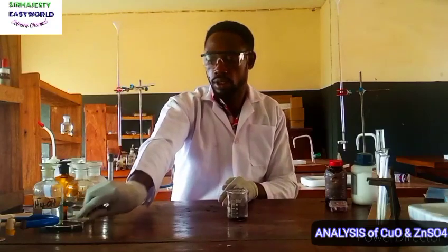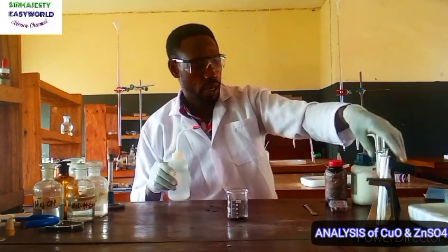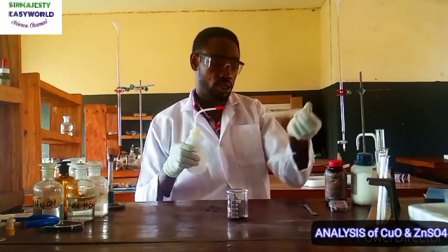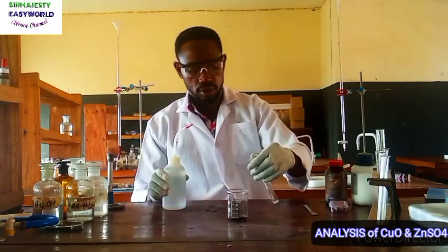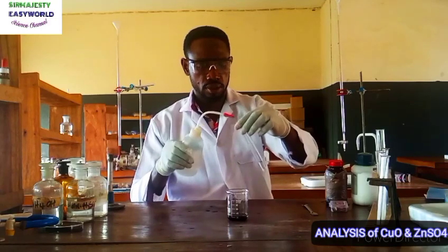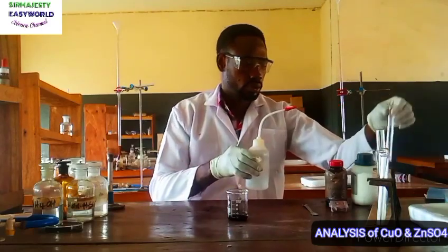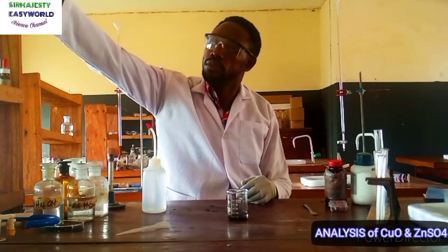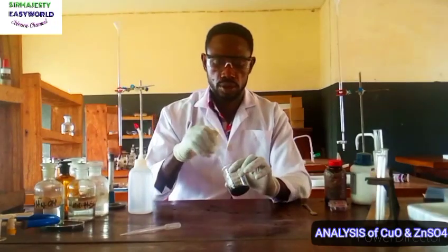Okay, let's put this aside. This is the water. They said about 10 ml. Remember, it's about 10 ml, so accuracy in the volume is not necessary, but this test tube is nearly 10-20 ml, so I'll take half. Just get what I can divide into 2 portions well. With the help of a glass rod, I'll stir well.